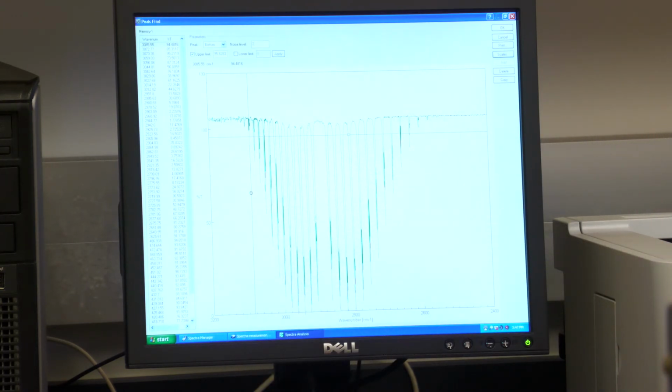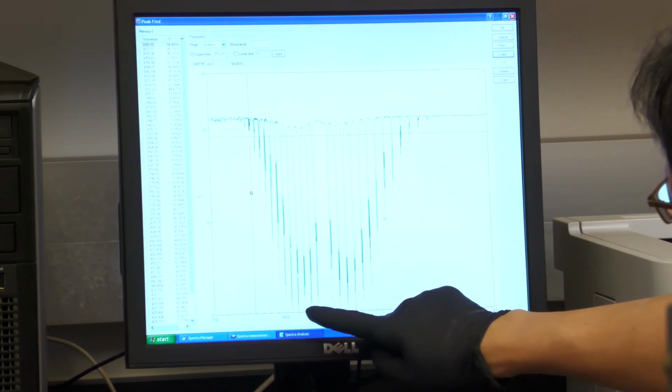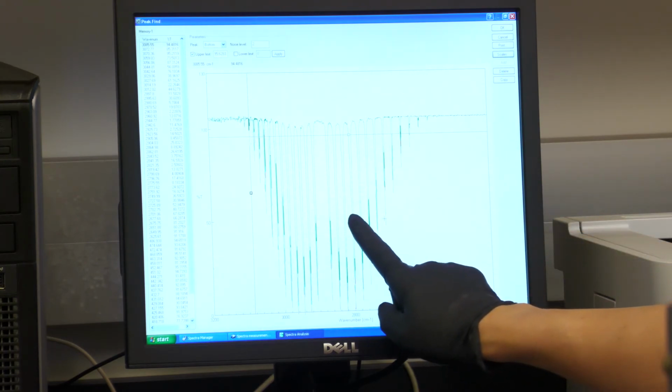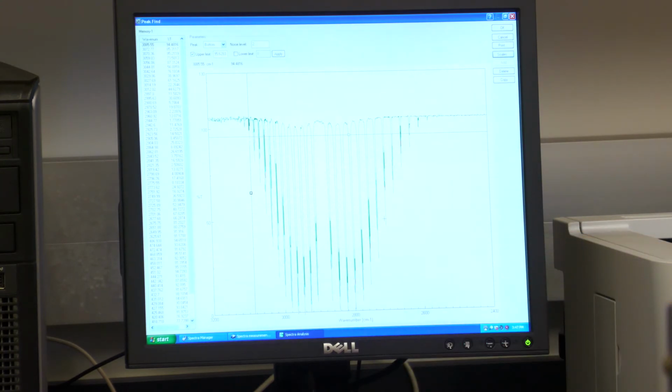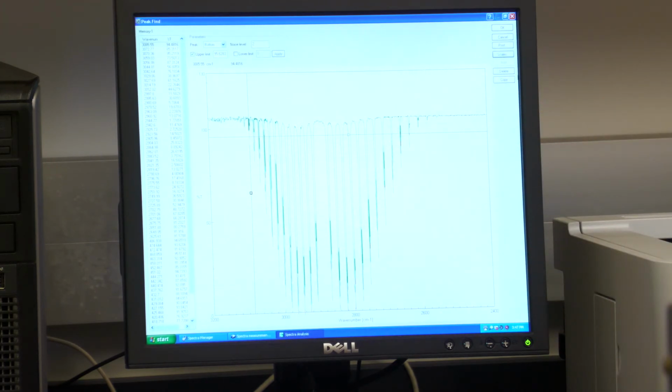So now we apply this one. Now how many peaks do you have? You have 1, 2, 3, 4, 5, 6, 7, 8, 9, 10, 11, and this part is 22. So that is more than enough. Now after we get this one, we will print this one. So you will select the peak, then you print this one, okay?